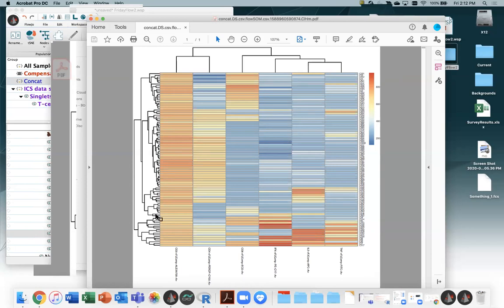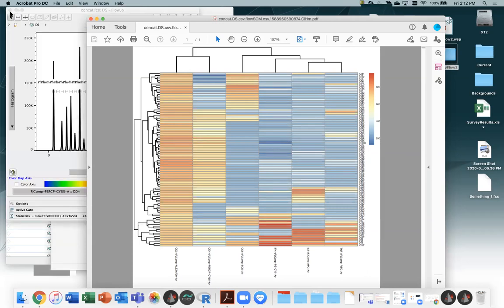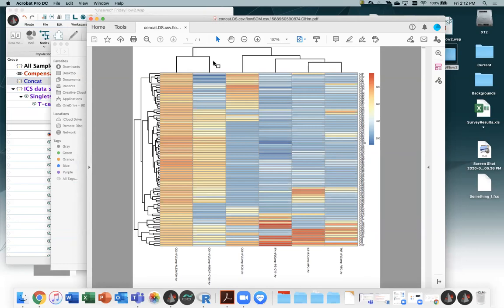And then maybe this is one more outlier, and depending on how many clusters you want to break this into, maybe there was actually 3 or 4 there. So 15 was actually probably a pretty good number. We could have maybe gone up to 16 if we said we think these are each 1, 2, 3, 4, 5, 6 right at the beginning, 7, 8, 9, I'd say 10, 11, 12, 13, 14, 15, and then depending on if we want to go, I guess it would be 16 or 17 if we wanted to give the outlier clusters each their own node.